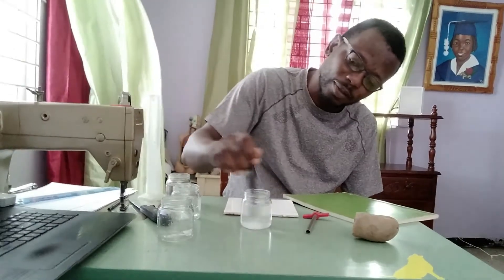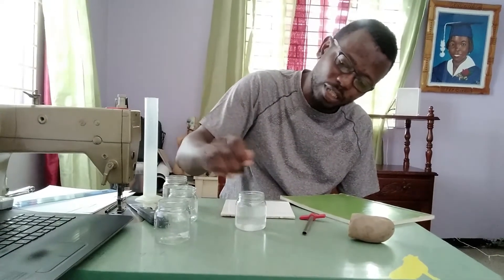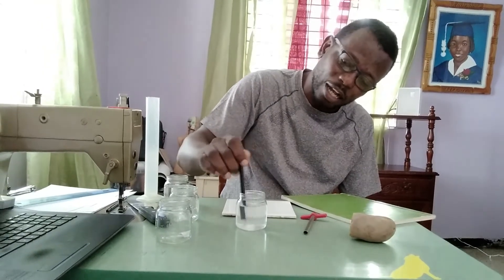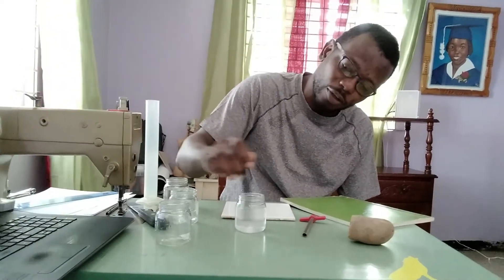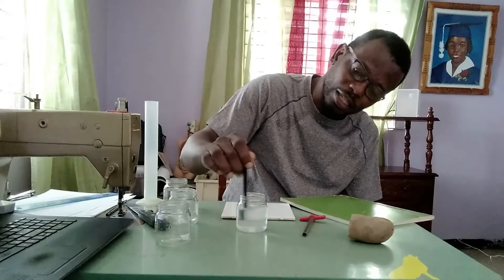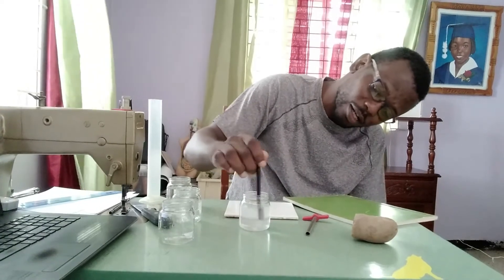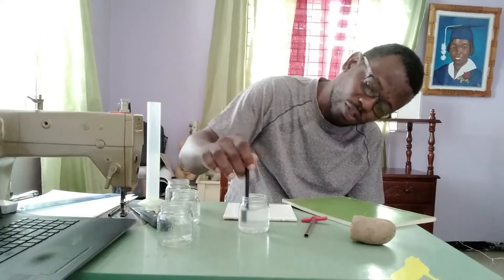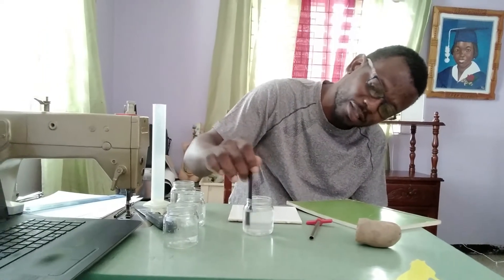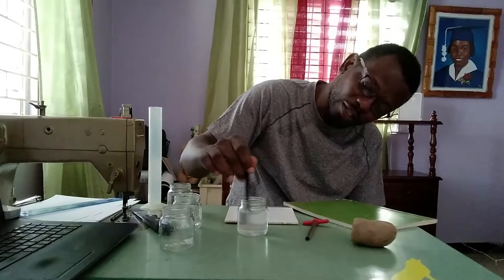We want to ensure that the salt — the sodium chloride — is dissolved in the water before we get started. We're going to use a piece of the potato, measuring the length and looking at the texture, and I would note how easily the potato will bend. The salt is dissolving in the water nicely. Remember we spoke sometime about solute and solvent. The stirring would have increased the rate at which it dissolved.